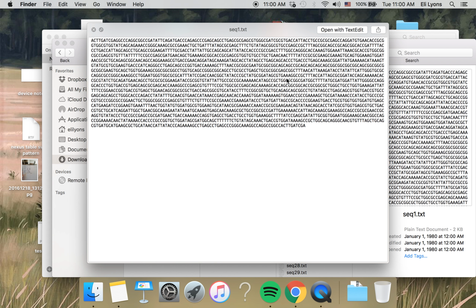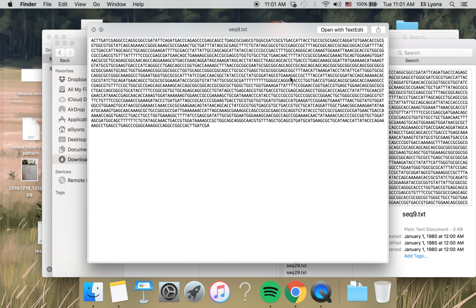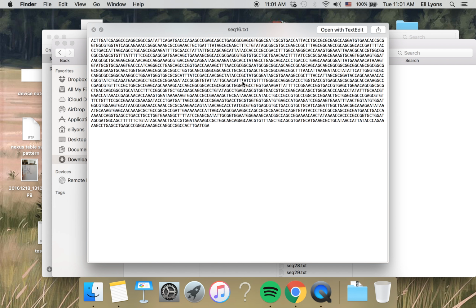You might notice, where my cursor is, that there's some change in each text file. That's where we generated the variations. Then let's go to template 3, and we see 52 sequences. Again, if I preview and scroll through the sequence files, I see variants occurring right around my cursor. That all looks very good.